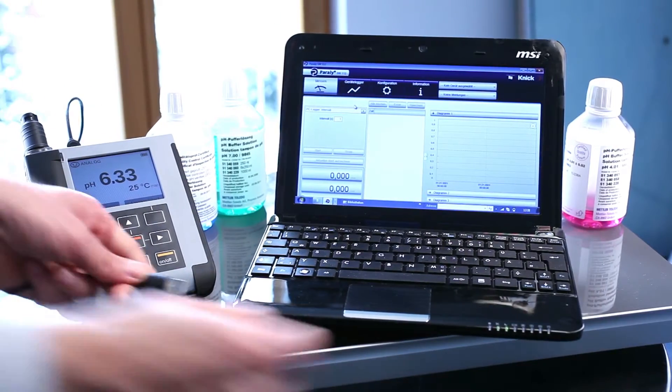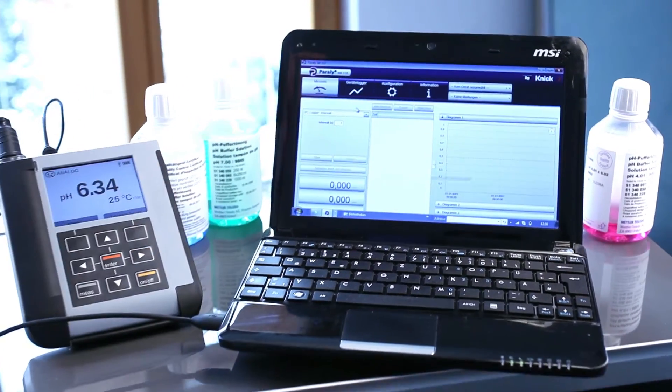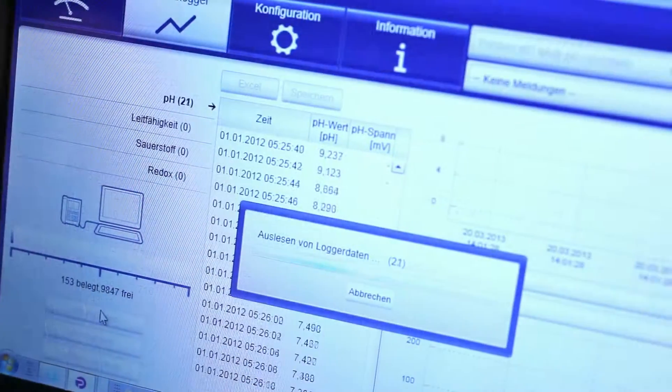The USB port allows connecting the Portavo to a computer to read out and process the data and measured values.